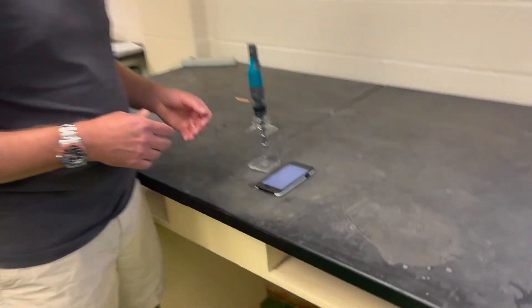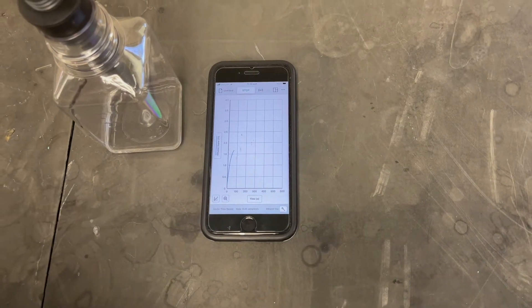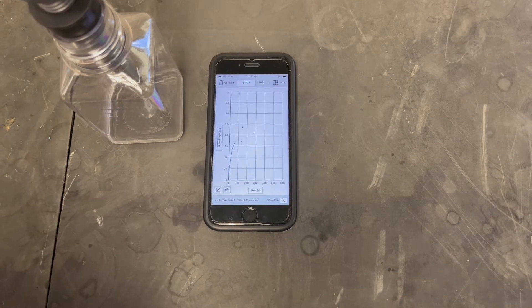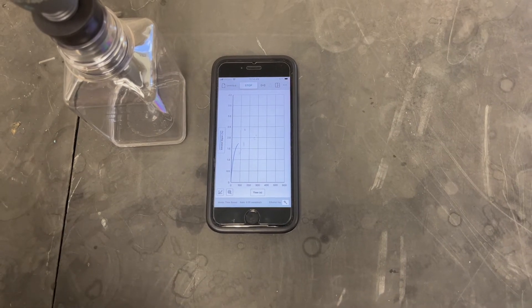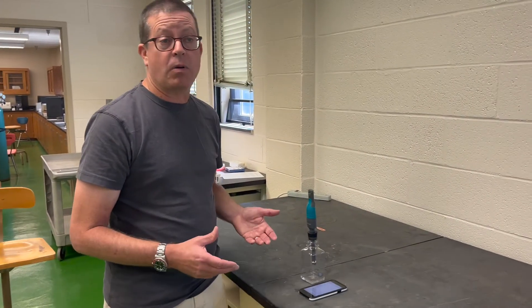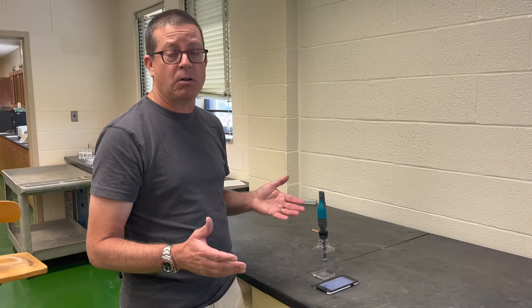Normally what we'd like to do is acquire the curve until it starts to level off. Looking at this, I'd say it will probably level off somewhere between 100 and 200 seconds. Once the curve levels off, that's when we take our reading to determine ethanol content. So again, it's a very nice inexpensive option — a good choice for somebody on a shoestring budget who wants to do internal quality control in their own small kombucha laboratory.